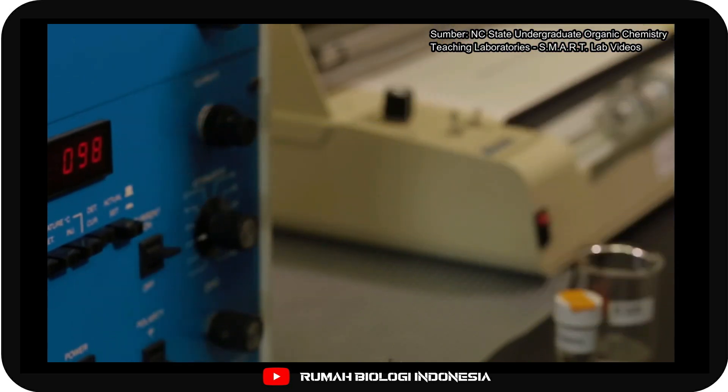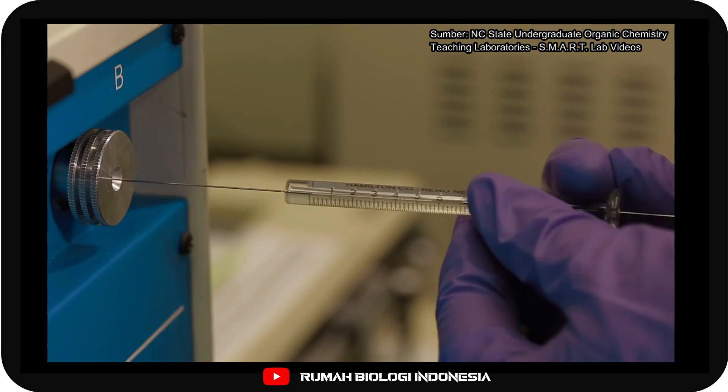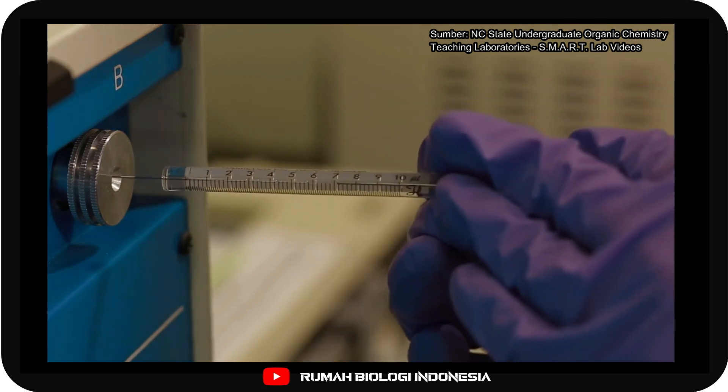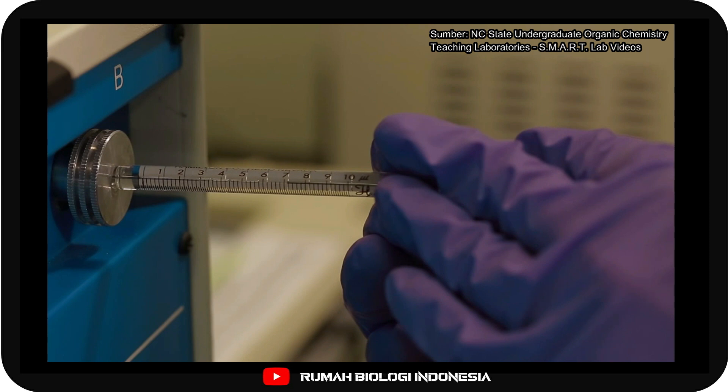Once the sample is loaded into the syringe, insert the needle into the GC injection port. You will feel resistance as you insert the syringe. Continue to insert the needle through this resistant material, called the septum, until the glass is flush with the injection port.